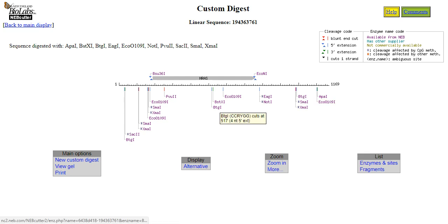Because it cuts right in the open reading frame. Bad choice. All right. Okay. One of the other parameters that I suggested, or that I require, is that if it's upstream and it cuts, you have to pick the one that's closest to the open reading frame, but not inside of it. Because often what happens is you're not only splicing your gene, then you're adding other elements and components to your recombinant. Right? Getting the gene in there is the first step.